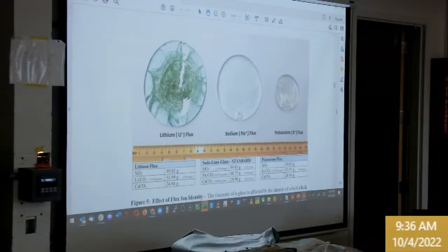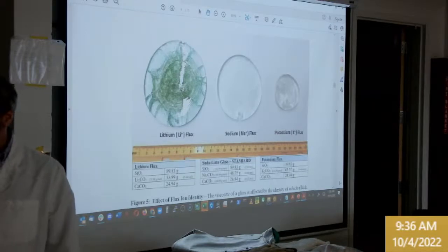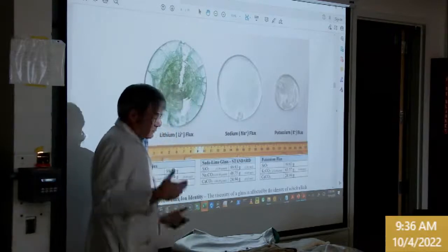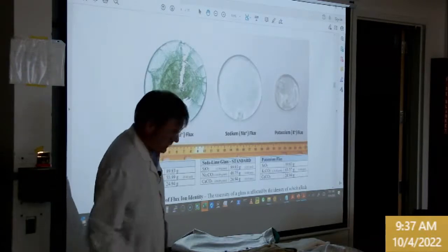And so the way that explodes is that it cracks and goes in all directions, but then follows a parabolic arc that is more likely to hit you in the legs with just little glass shards, chunks of glass. And so that's what you expect. You kind of hear a snapping sound, and then it goes in that direction. I can usually tell glasses that look stable or not stable. We'll talk about that. It varies year to year, but don't be too surprised if we have some that do that. That's why safety glasses, safety goggles are important, but usually the glass shards are in that area.